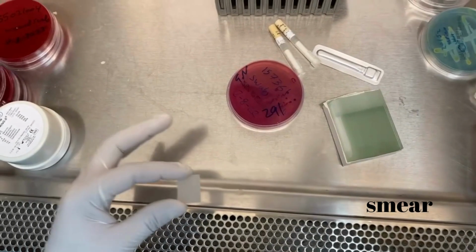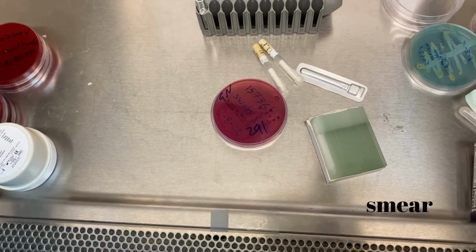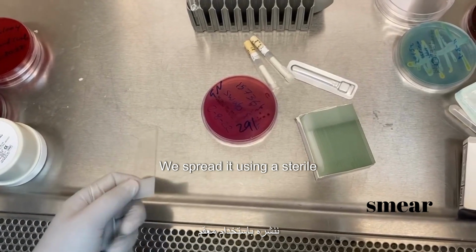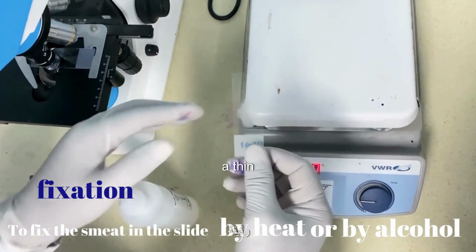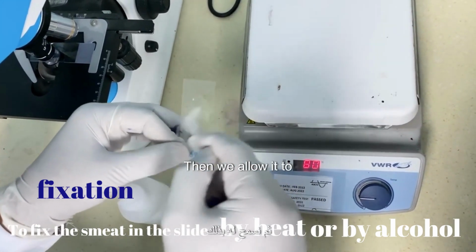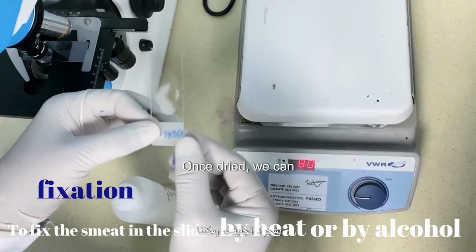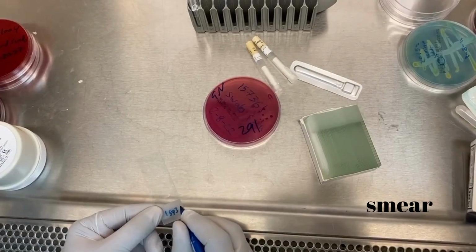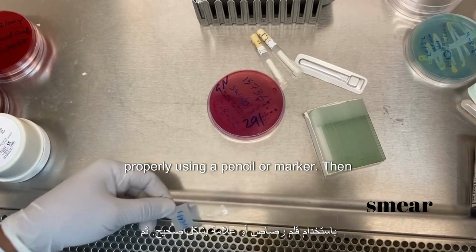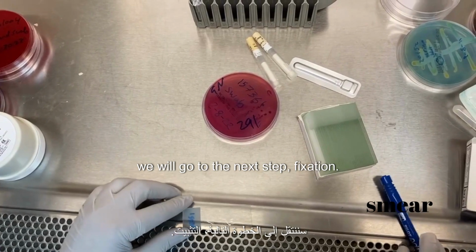First, we should place a small drop of bacterial sample on a clean glass slide. We spread it using a sterile loop into a thin, even smear. Then we allow it to dry spontaneously in the air. Once dried, we can label the slide properly using a pencil or marker. Then we will go to the next step, fixation.